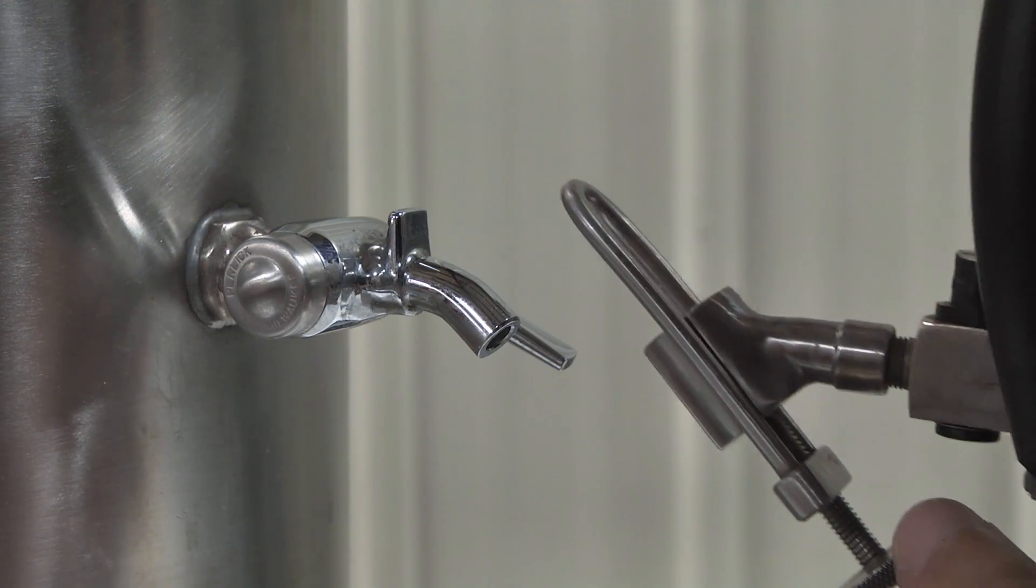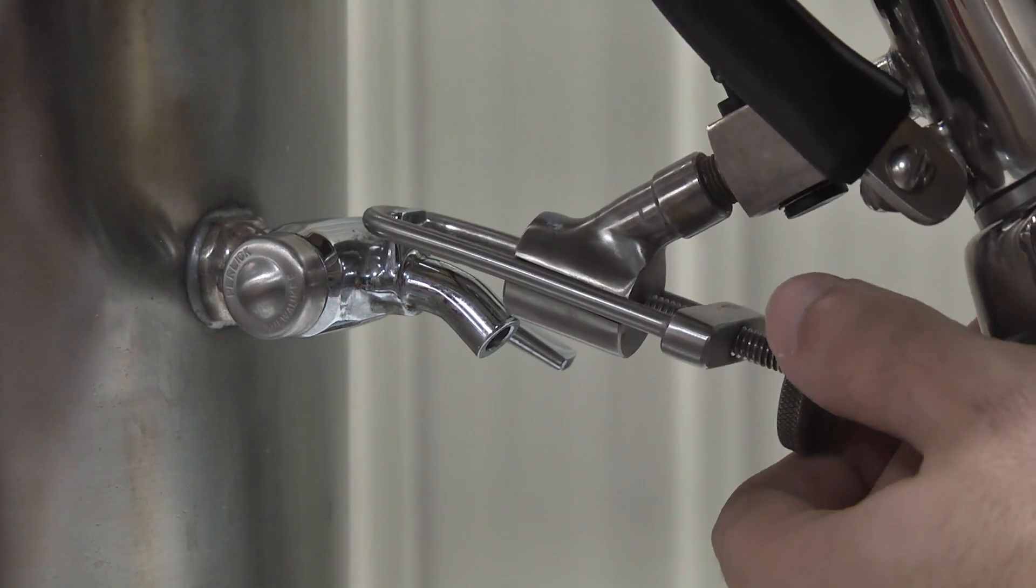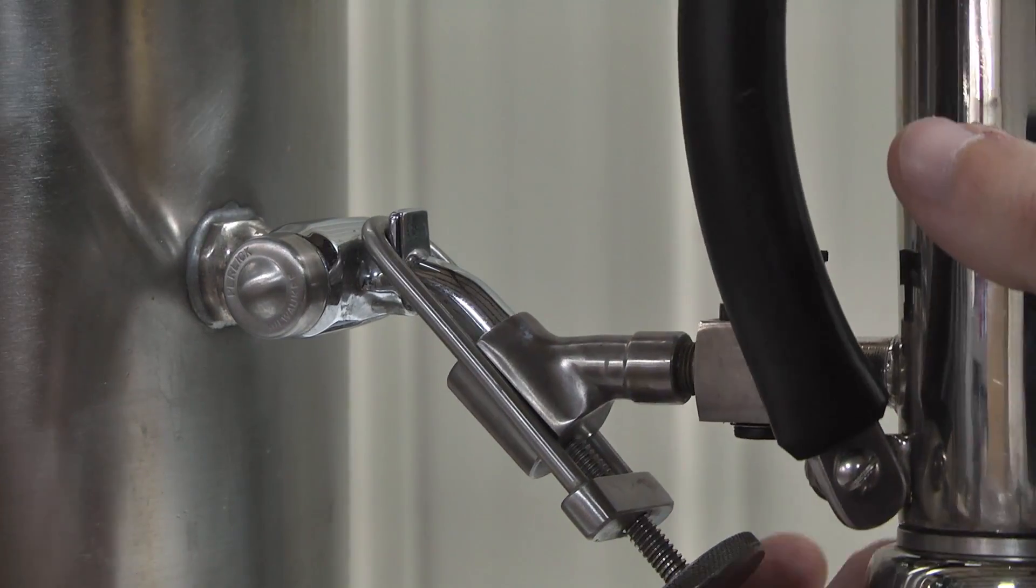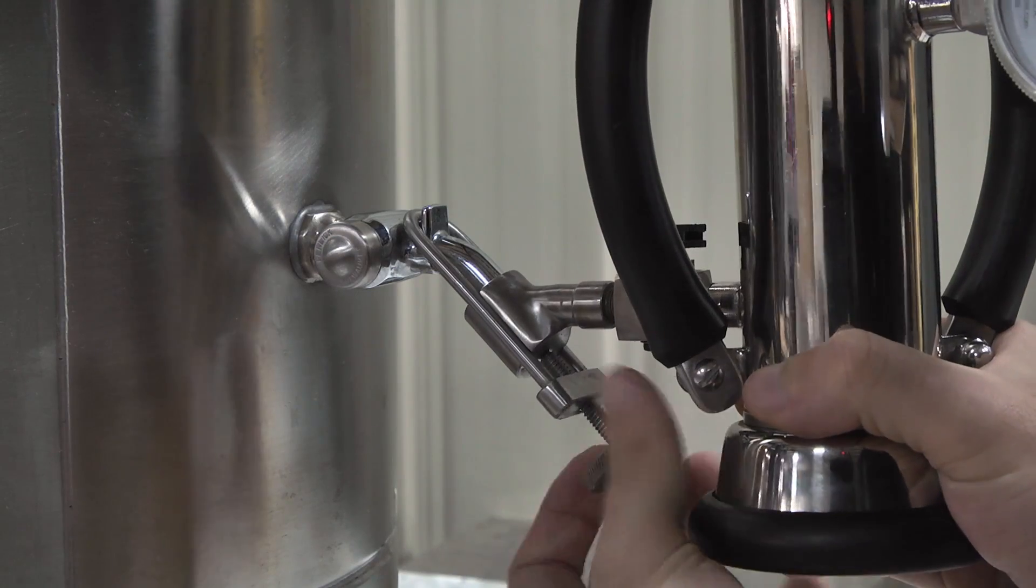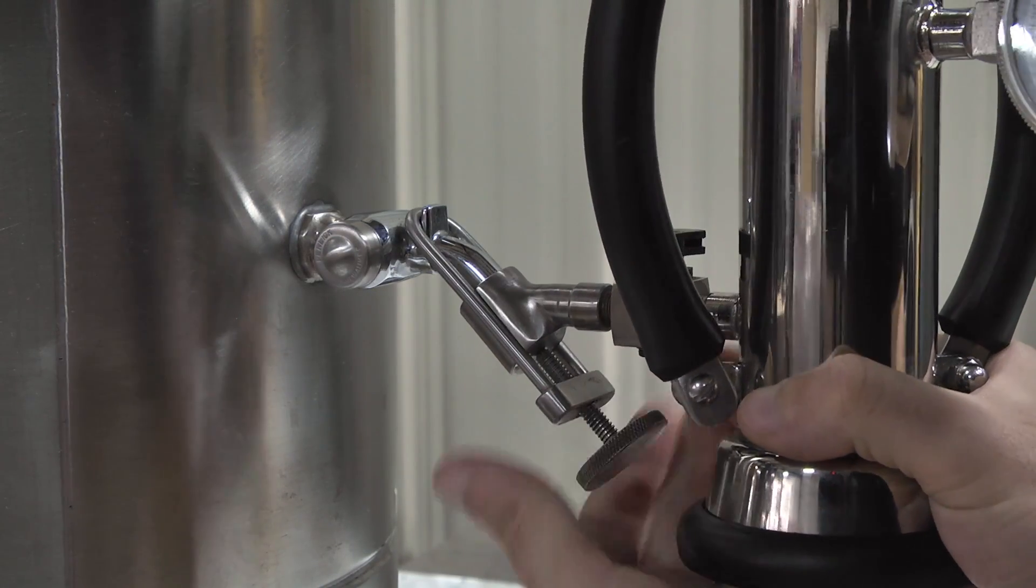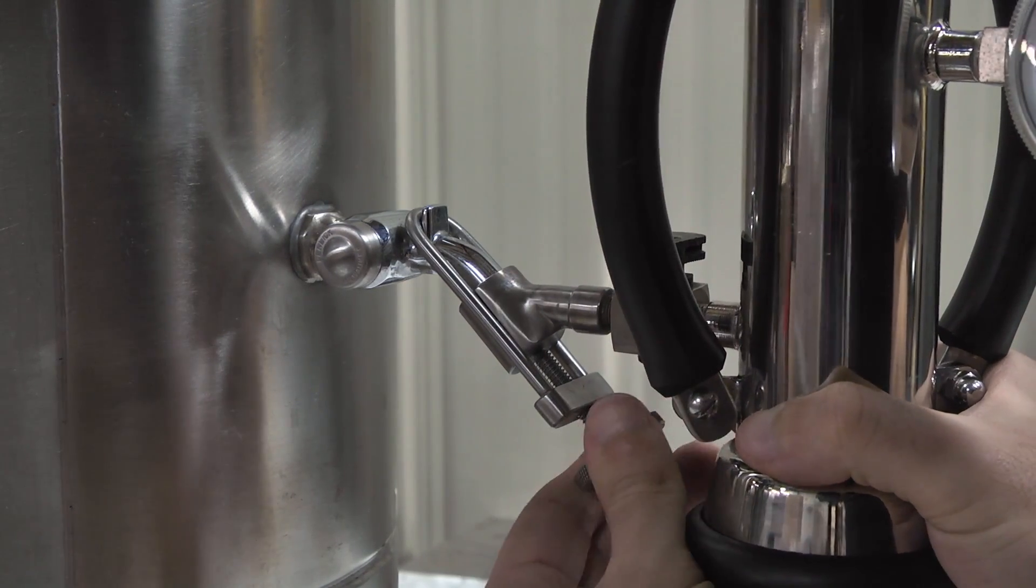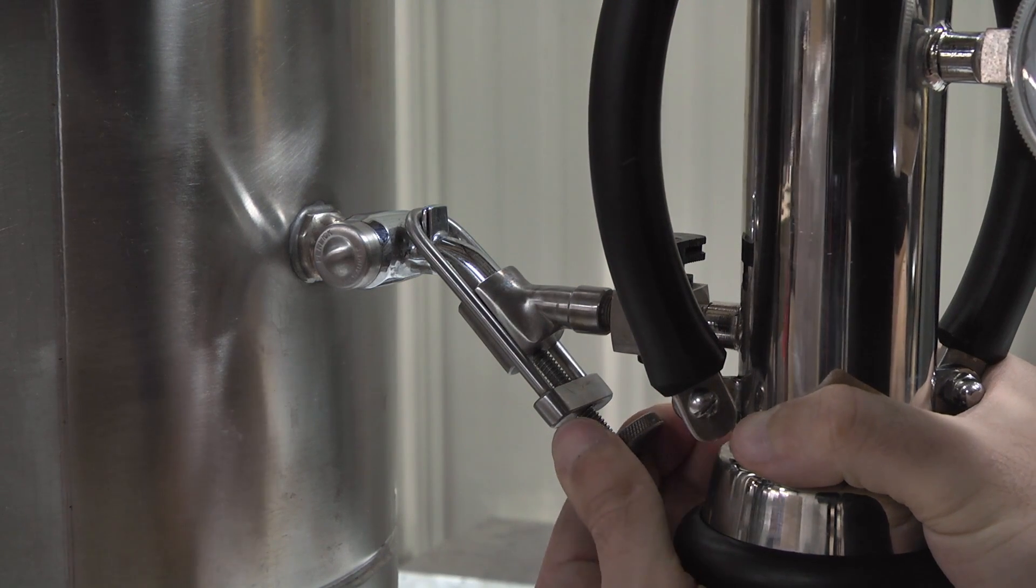Attach the volume meter to the tricock of the tank by opening the clamping device screw and sliding the clamping device yoke over the boss of the tricock. Turn the clamping device screw clockwise so that the clamping device gasket makes a tight seal between the tricock and clamping device assembly.